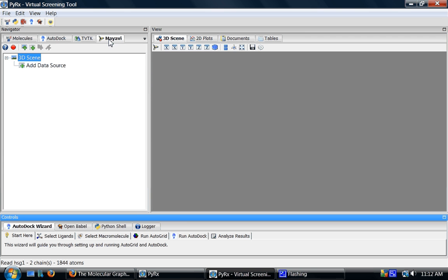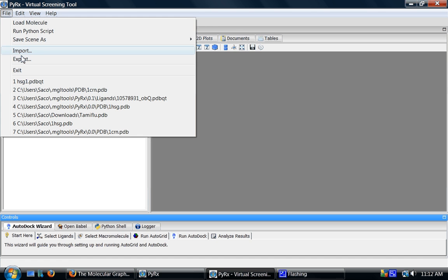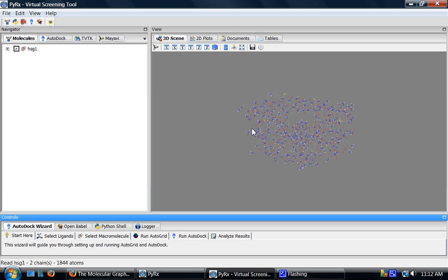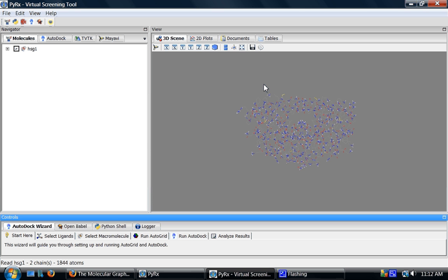I'll then use MayAVI to visualize volumetric data. I'll start by reading a molecule from the previous screencast. Here is that molecule.